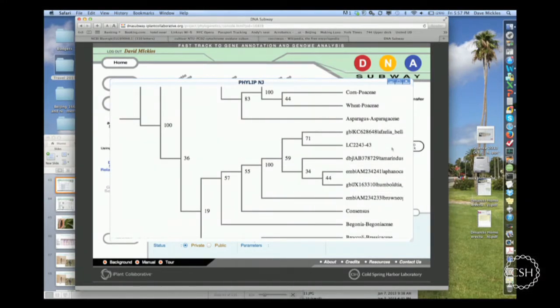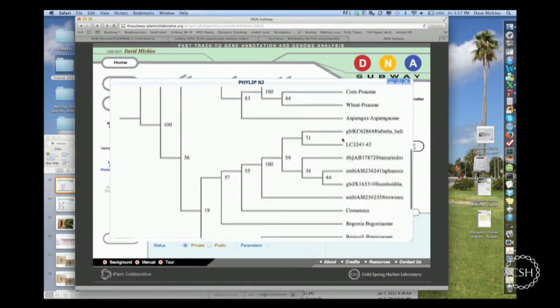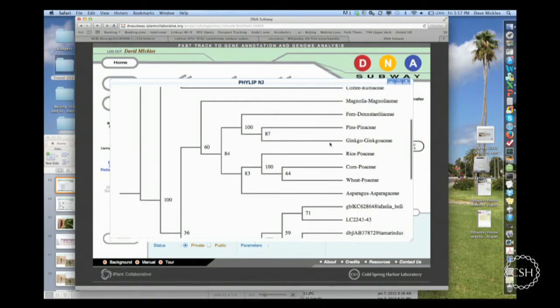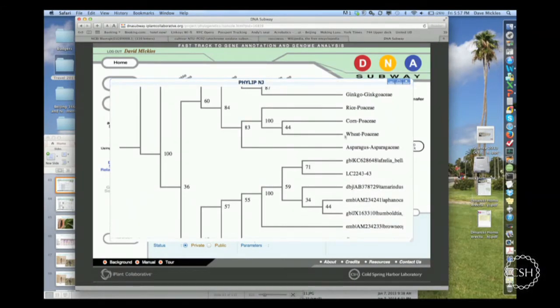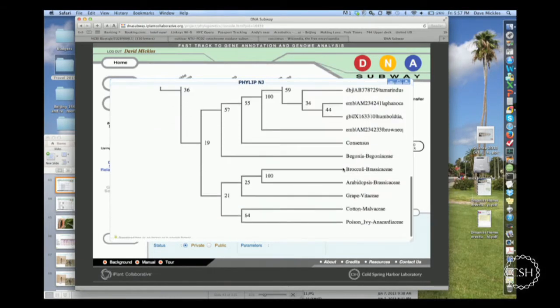and yes, they've shaken out there. And you'll see that at least of the things we have here, the begonia is the closest, most closely related of the common plants here. Of course, these are monocots over here, so we can understand that they're not closely related.